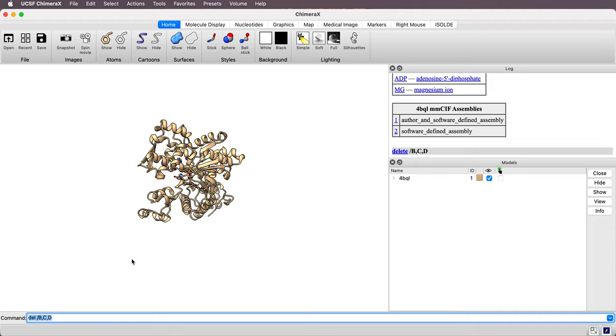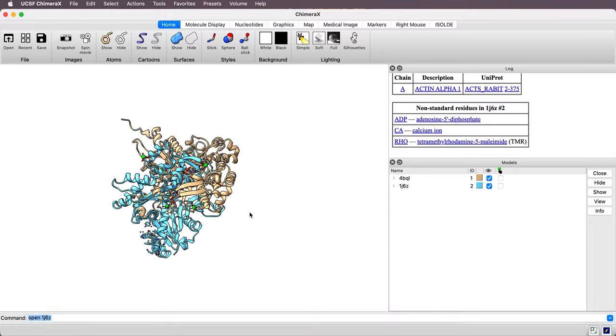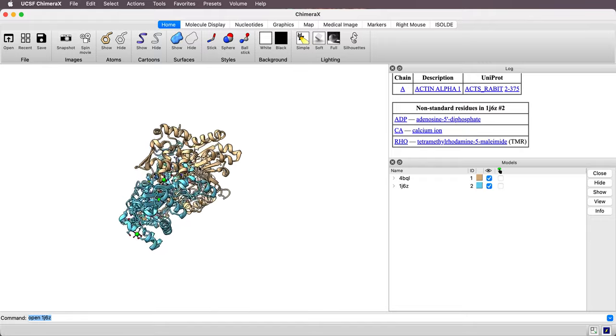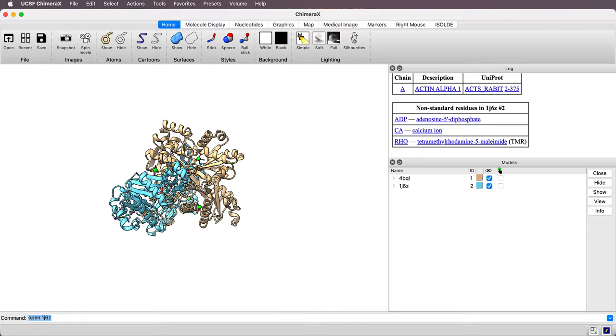Okay, so this is an archaeal version of actin called Crenactin. And now let's compare it to a rabbit version of actin. So I'll open PDB 1J6Z. And they're not aligned with each other.